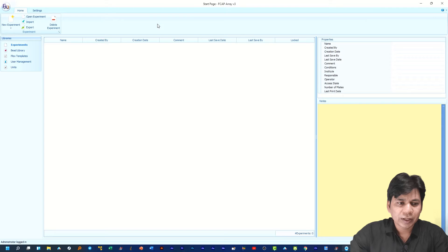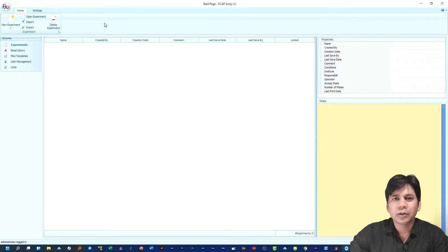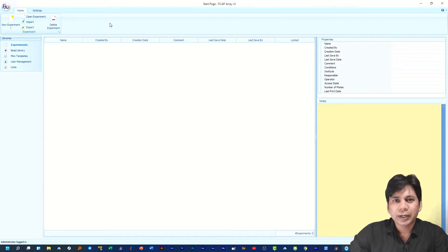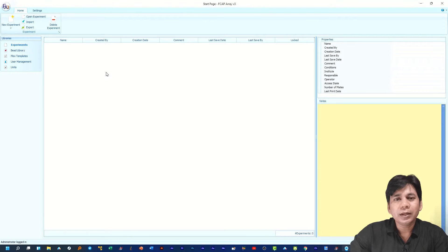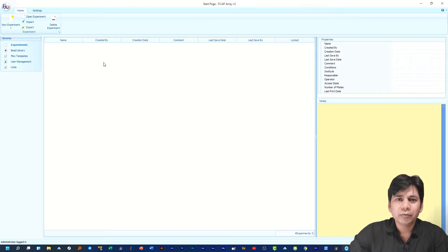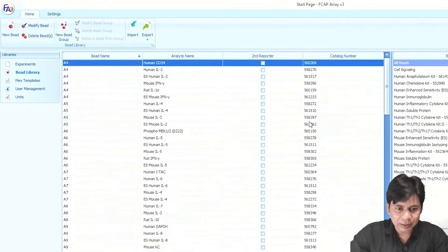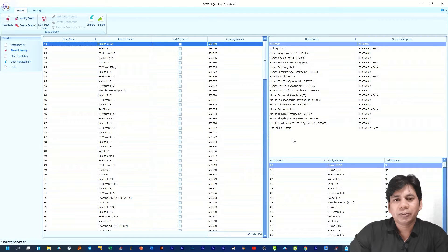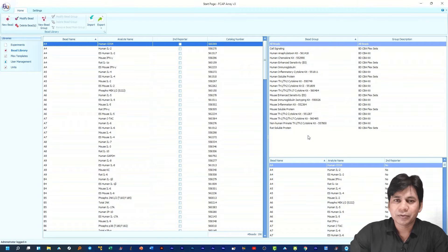This is the interface of FCAP Array version 3 software. Before going through the data analysis, I just want to inform you that for any data analysis using FCAP Array, we need to download the bead library for the CBA kit and the CBA Flex Set. Without this bead library you cannot perform any data analysis in this software. If you click on 'Bead Library,' you can see that if you are using FCAP Array for the first time, you have to download the bead library from the BD Biosciences website and import it into this software.